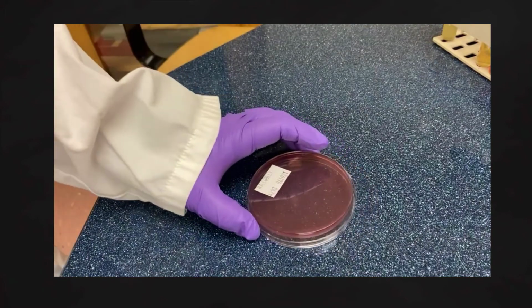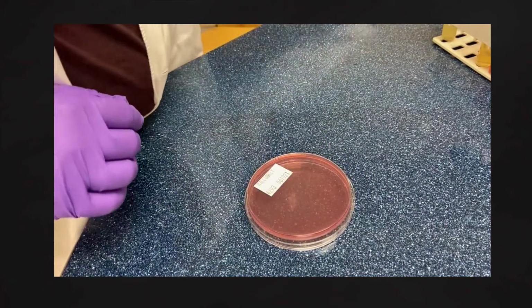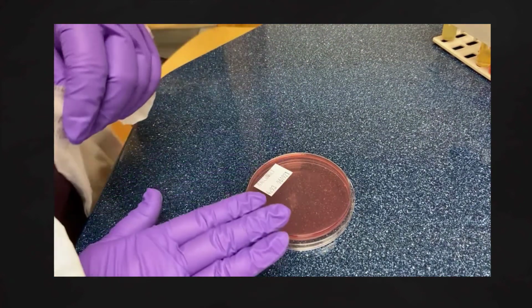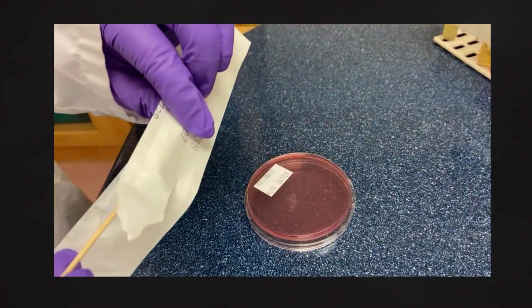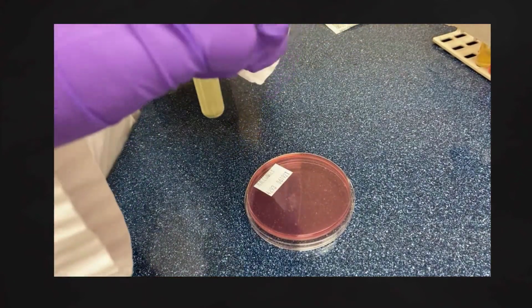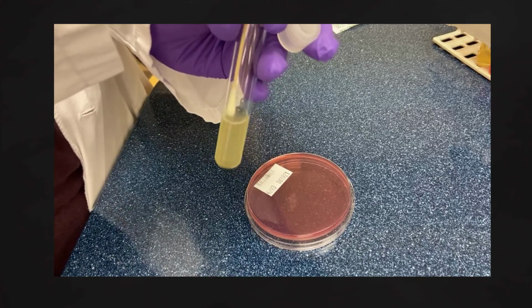Now, in this particular case with the McConkey's, I don't really need an isolated colony here. So I'm just going to do a zigzag pattern type of inoculation. Again, though, I want to use a sterile cotton-tipped swab. I'm going to still use my broth with my E. coli that I have in here.